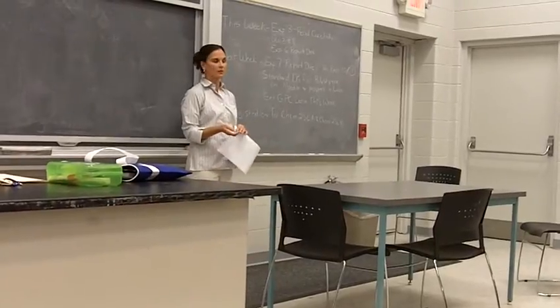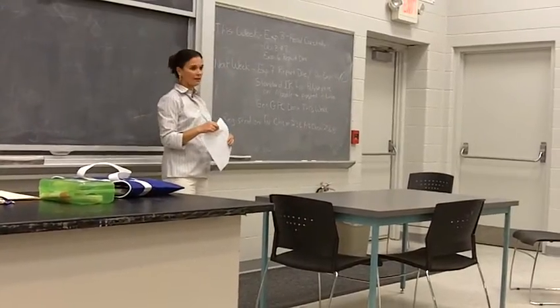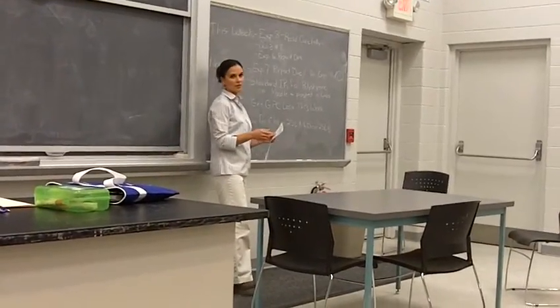This week in lab, we are doing the much anticipated experiment 8, the Grignard reaction. And luckily, it's not going to be raining apparently either Tuesday or Thursday, so that's unusual. When you do anhydrous reactions, usually it's raining.